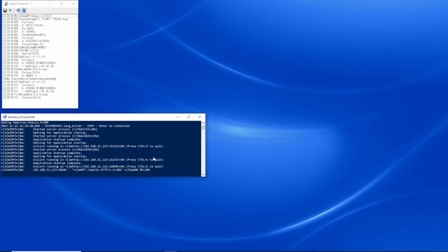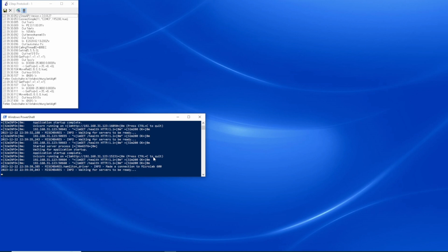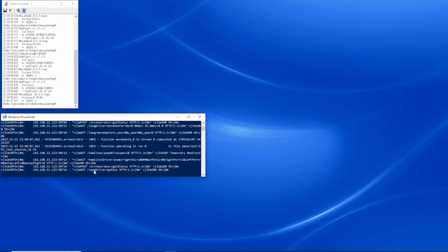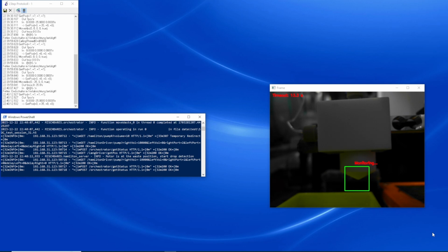Now I am going to demonstrate one of the quality control measures that is implemented there. Once all devices are initialized, the experiment begins. You will notice in my PowerShell that the motor moves to the waste position. It then attempts to pump some material. A video automatically pops up, displaying a green frame indicating the region of interest. The frame is used to detect motion using the OpenCV library. As you can see, we observe no material present.